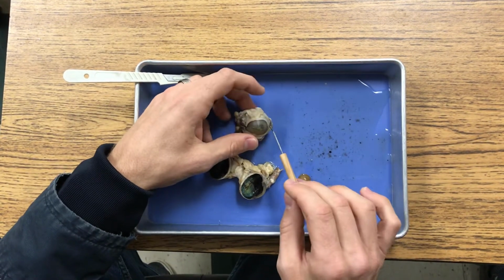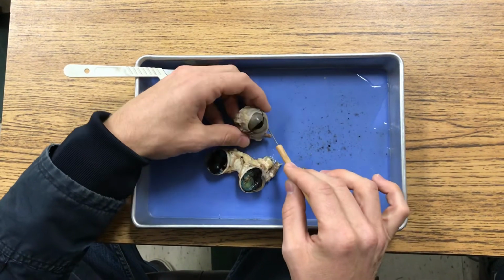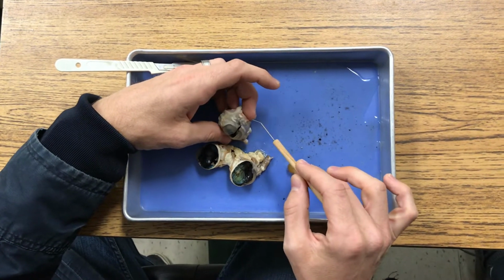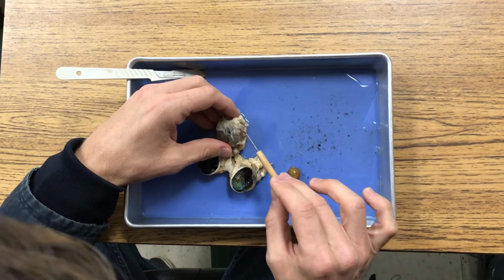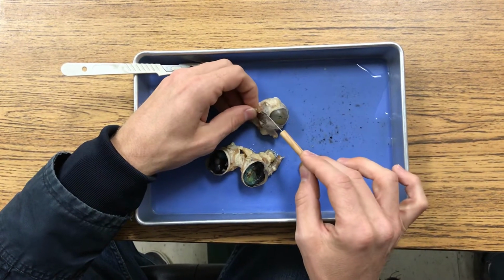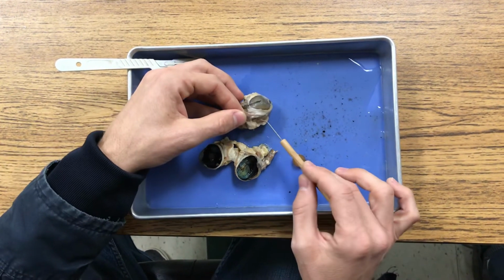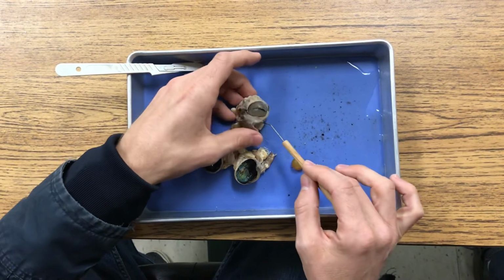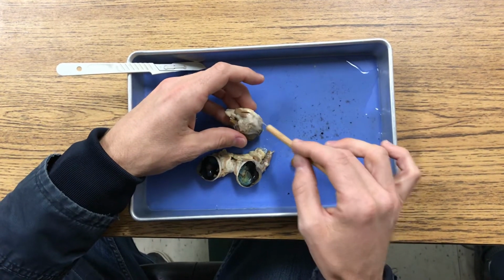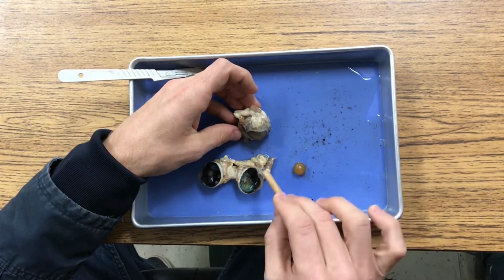All right, and then we have the muscles that move the eye, okay, and this is a right eye, so this would be the medial side, and so you have a muscle here, which is the medial rectus, a muscle on the outside, which is the lateral rectus, a muscle underneath, which is the inferior rectus, and a muscle on top, which is the superior rectus. Looks like it's coming out here. Okay, and so those move the eye left, right, up, and down.